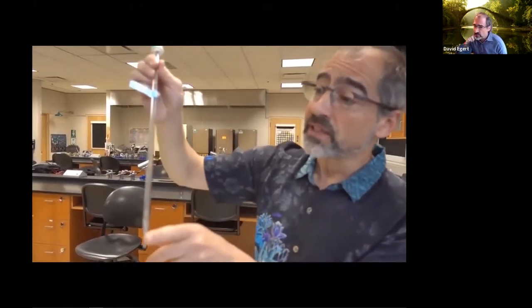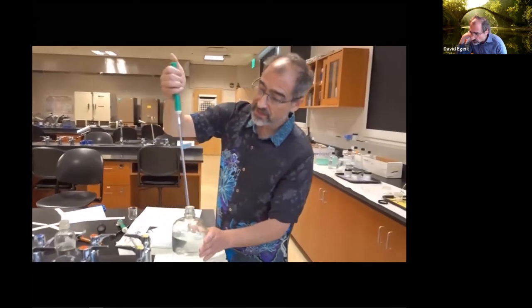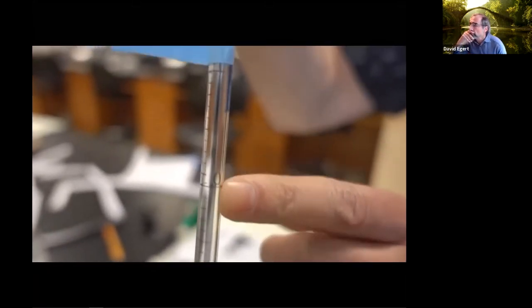And the way it works is you would put it in the liquid you're trying to pipette, and the numbers actually kind of go upside down. They start at 4 at the bottom, and then 3 to 2 to 1, and 0 is up here. So the technique you would use is you actually suck up until you are at the 0. And that means now there is 5 mils in the pipette.